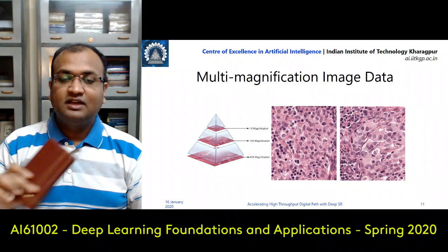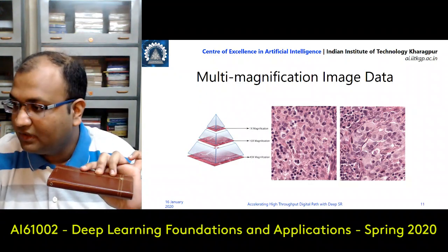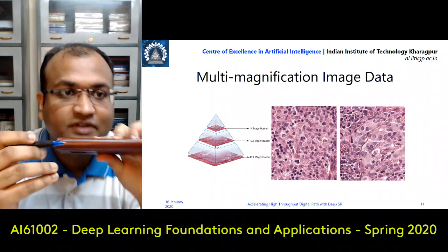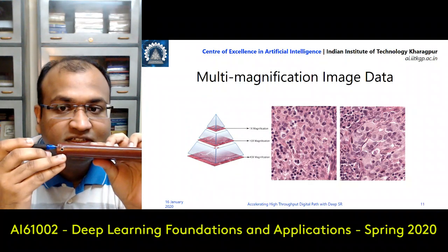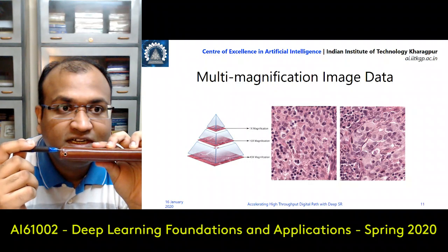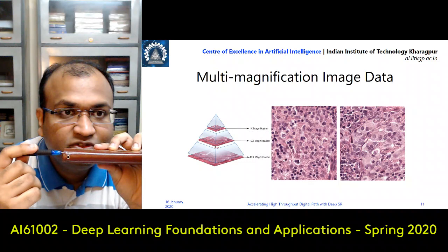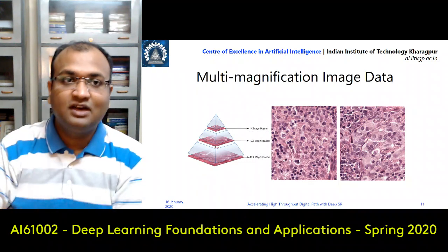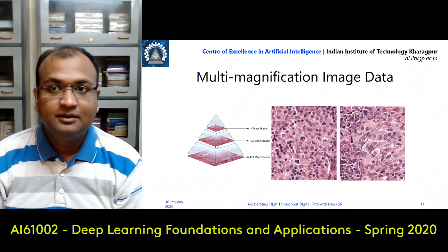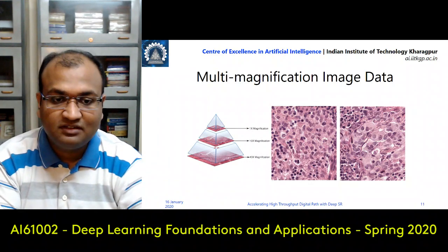So if I am at higher magnification and this is the thickness of the slice, and I come closer. Now if the thickness of this nib of my pen is the best I can do, now that it is going to be lower, I will have to acquire more and more things on the depth axis as well. So this is a major problem, which slows down the speed. That's the problem we were trying to solve when this solution was getting developed.